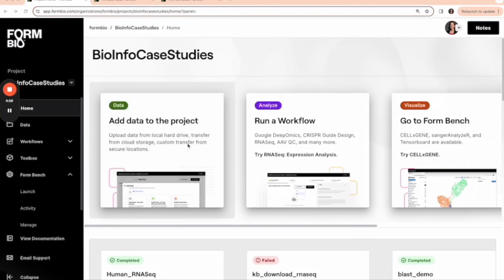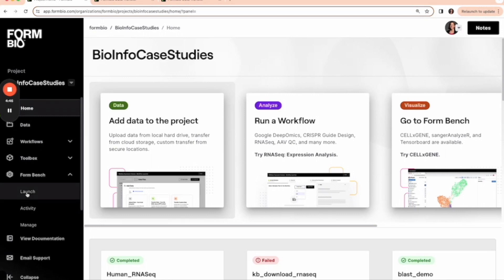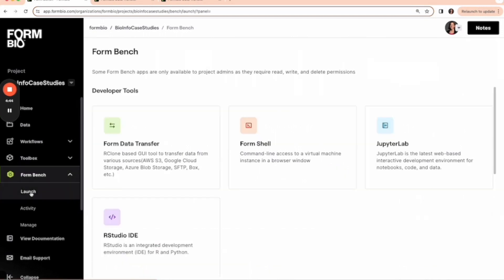Today we're going to download data using an FTP site onto the Form Bio platform. The first thing we're going to do is navigate to the left navigation menu and click launch under Form Bench.